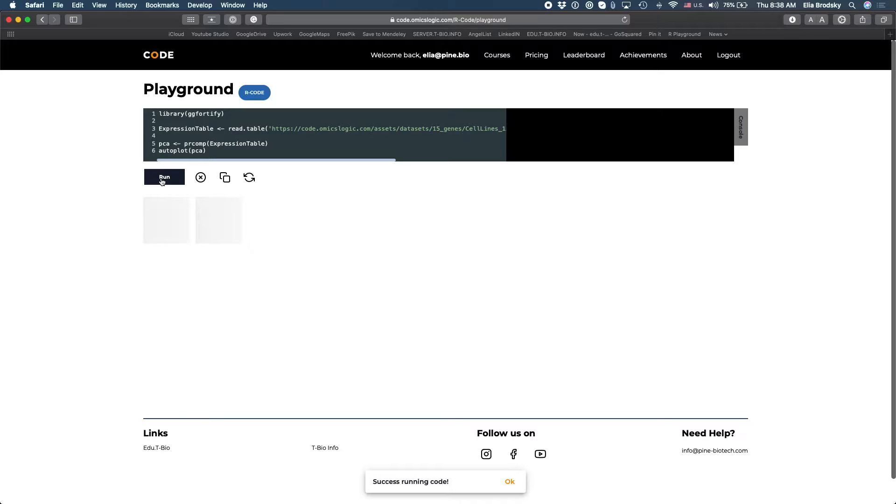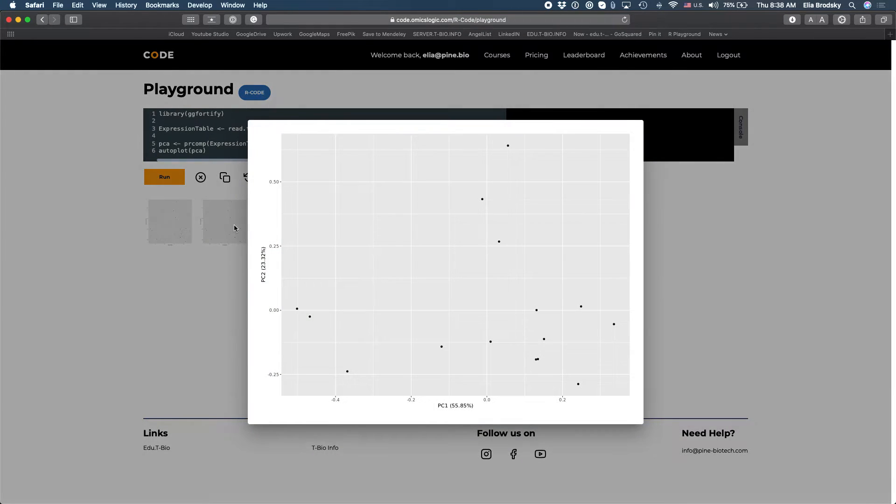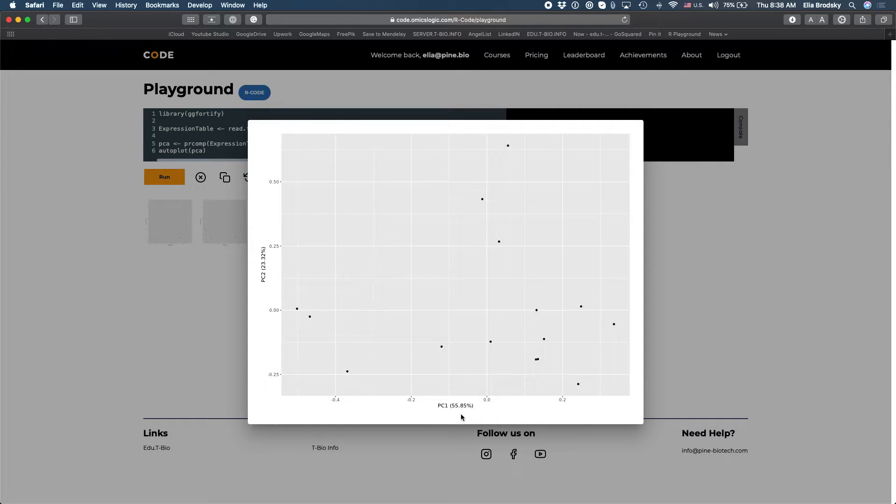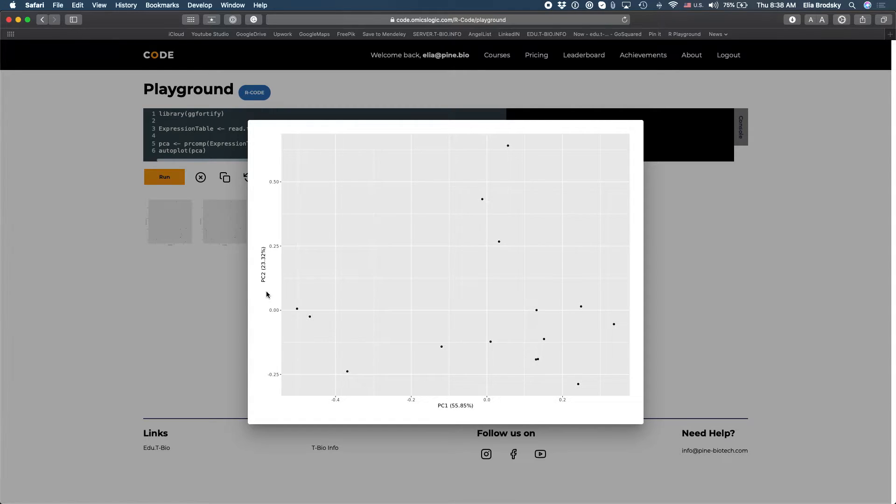Okay so the code ran successfully, you can see down here success running code, we can look at this plot. This plot shows us principal component one which explains about 56 percent variability between these elements and PC2 which is about 23 percent.